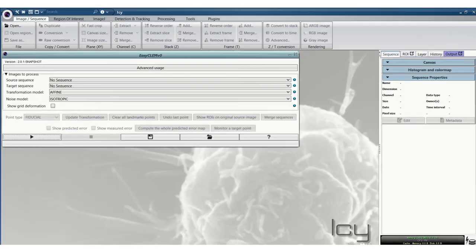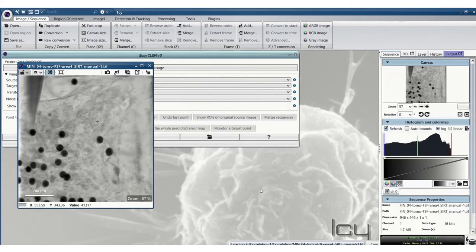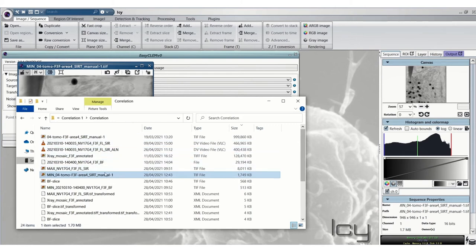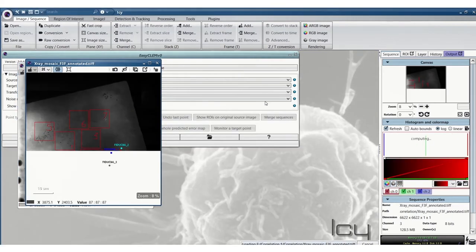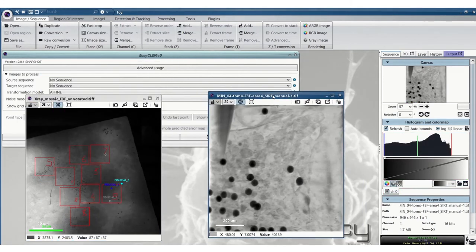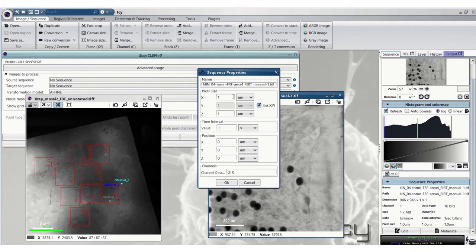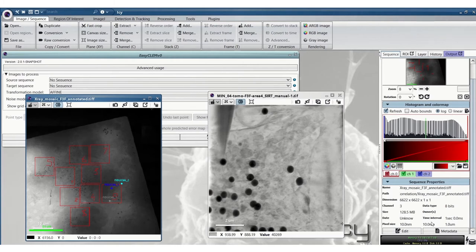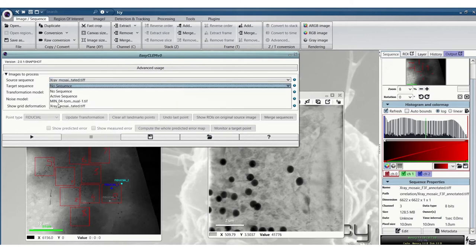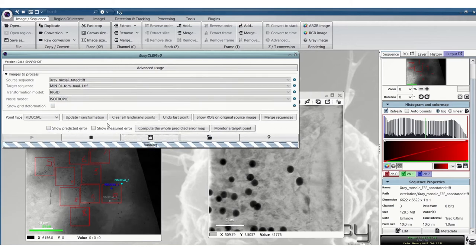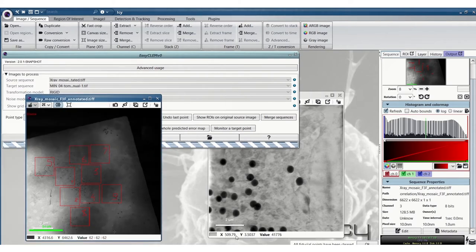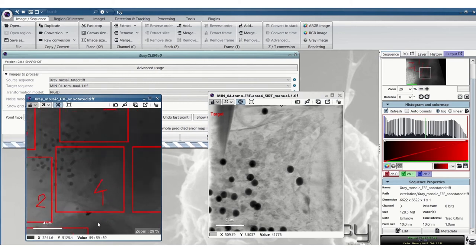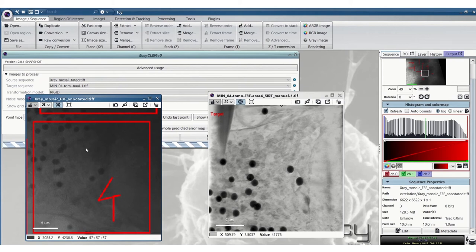So now we'll do the same with the x-ray mosaic and the tomogram images. Again, remember to correct the pixel size if it's wrong. So here we can zoom right in, this is why it's useful to use the annotated x-ray mosaic so you can easily find the exact area where you've taken this particular tomogram.